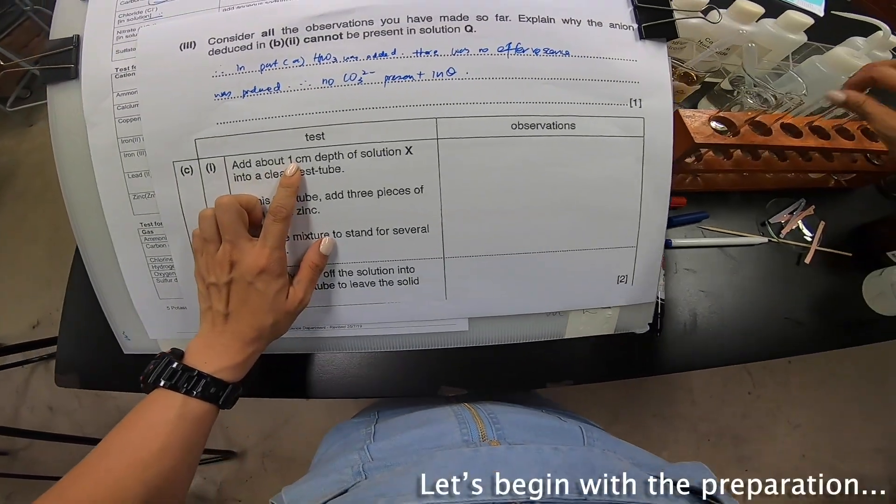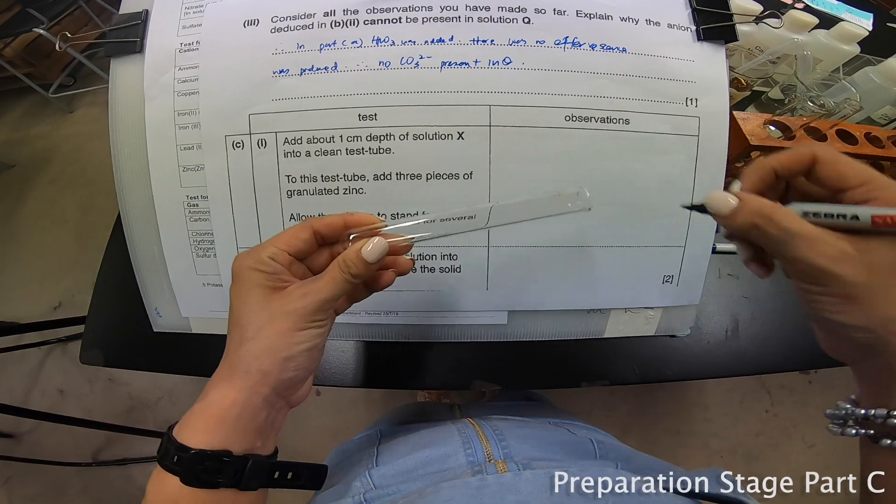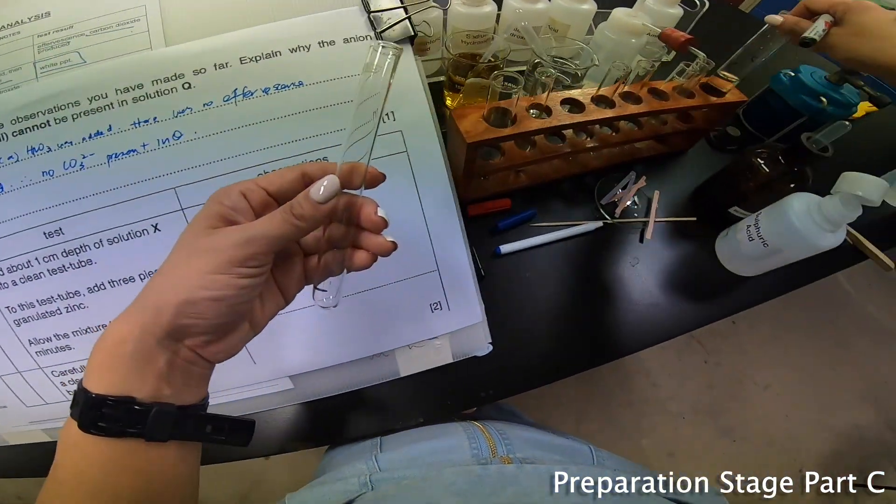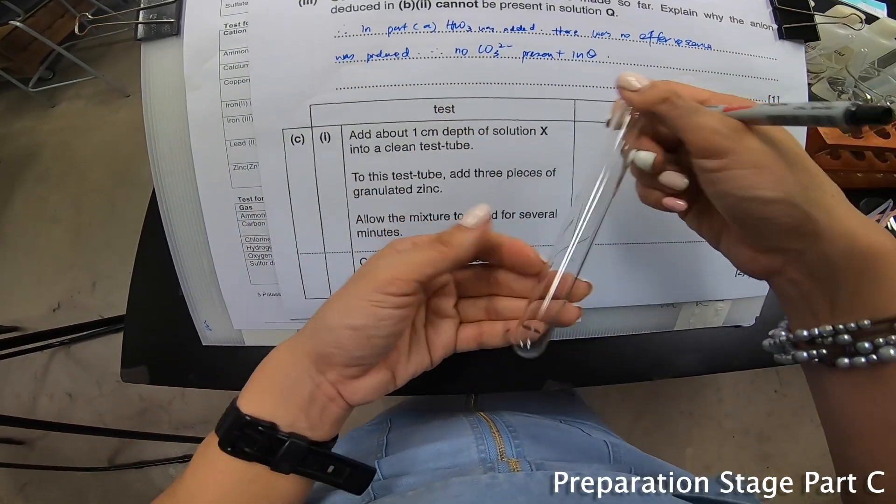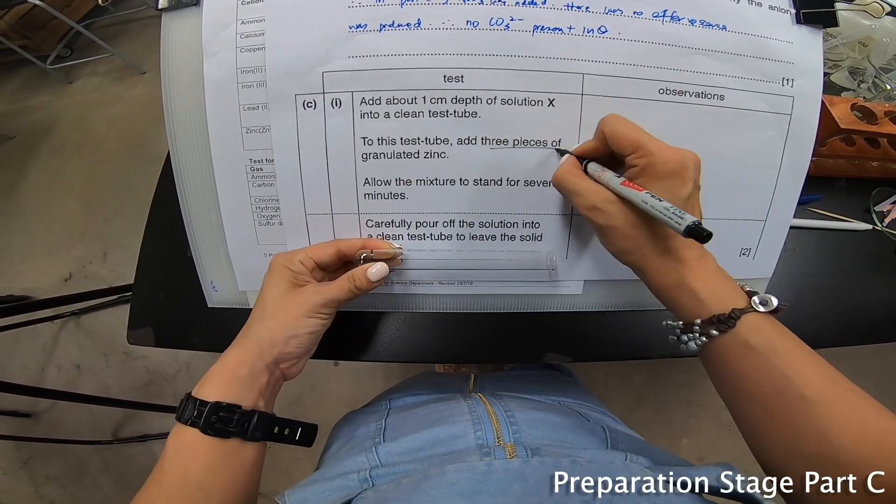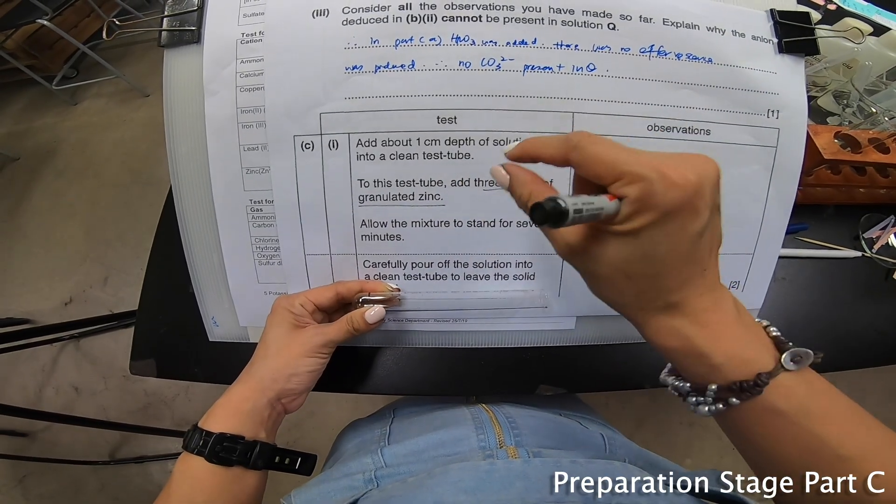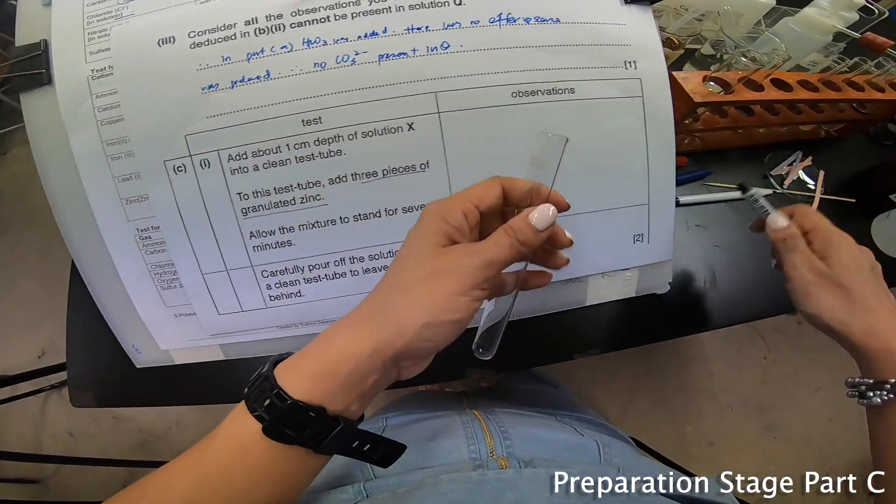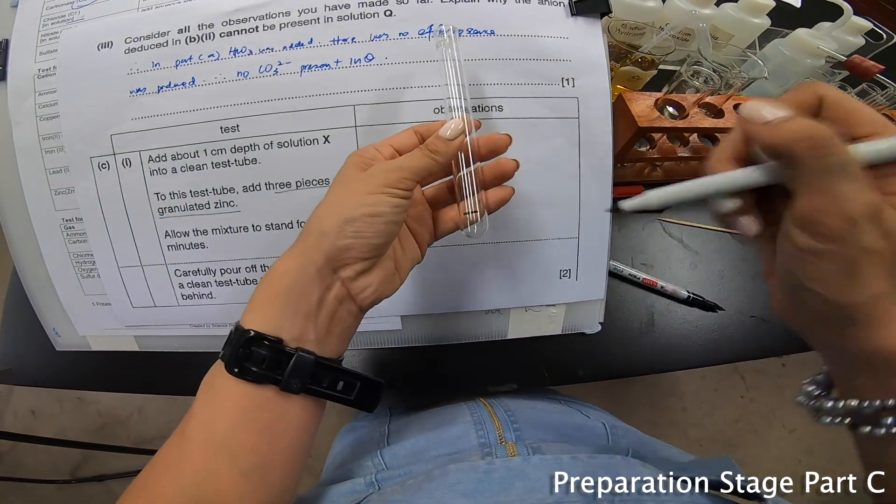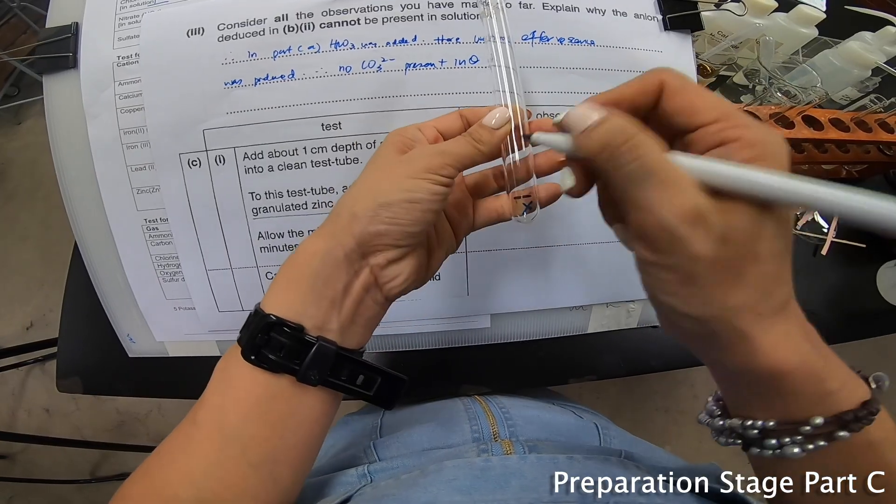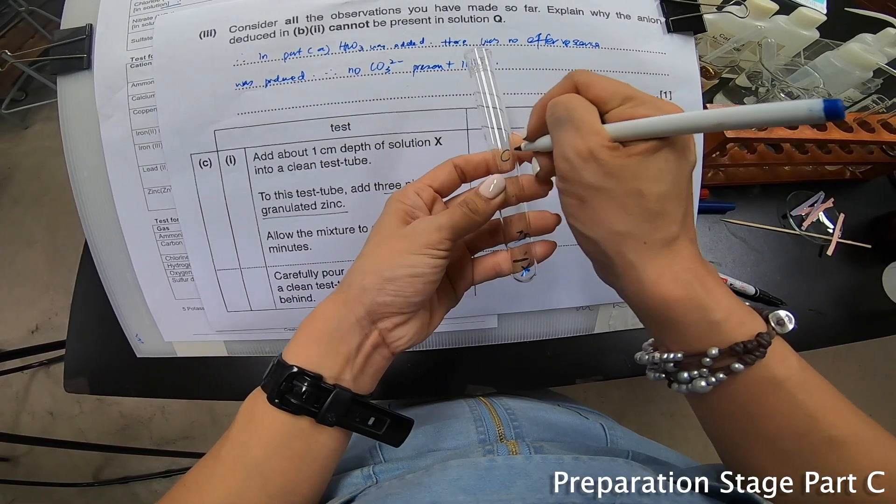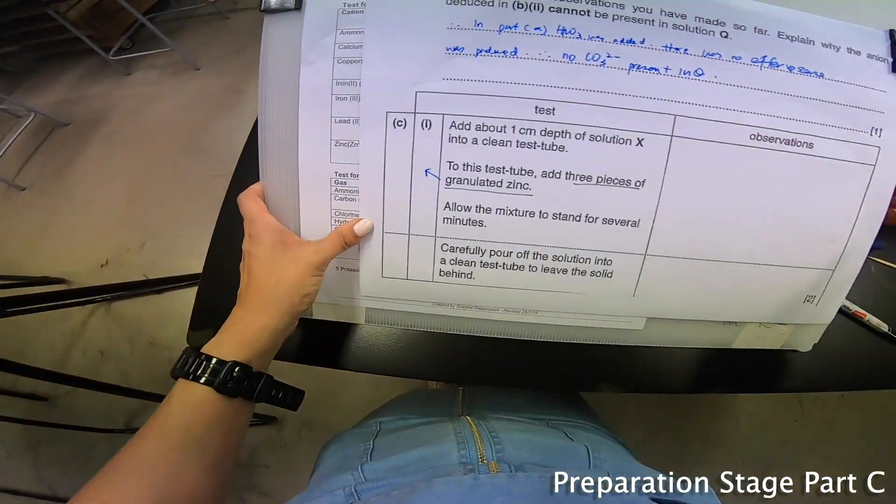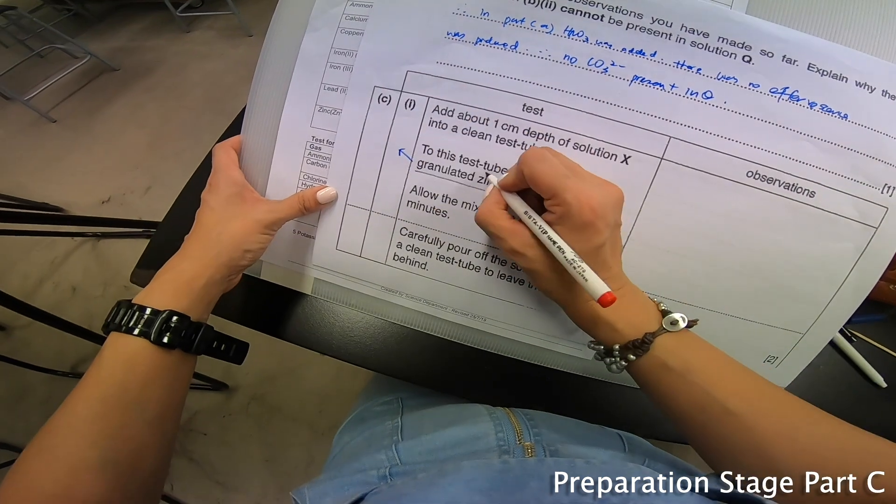Moving on to C part 1, let's do the preparation. This is the clean test tube. Add about one cm³ of X into a clean test tube, then add about three pieces of granulated zinc. Allow the mixture to stand for several minutes. Let me label it properly - this is my X, and zinc was added. Let's label C part one.